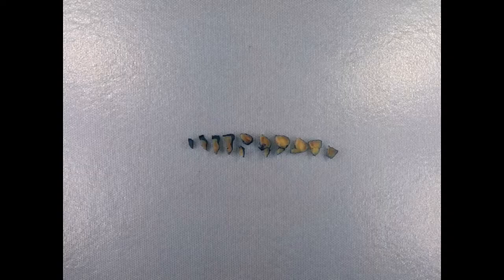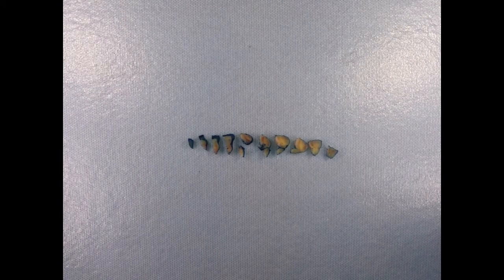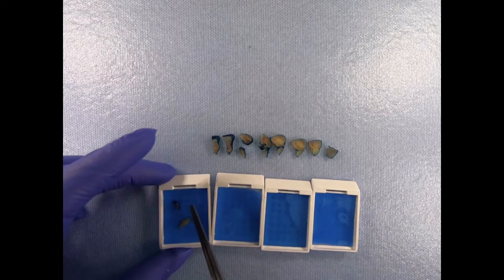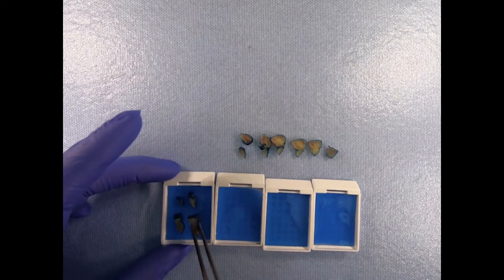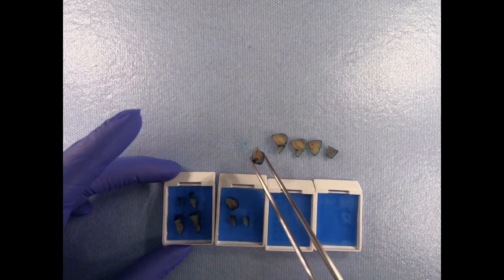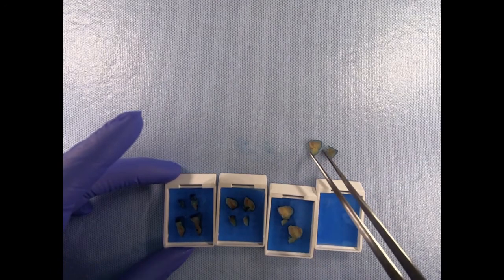Internal examination. If tumor can be identified, describe the lesion, depth, invasion, and distance to the margins. Processing. Submit the entire specimen sequentially, working from one end to the other. If the specimen is oriented, specify the 3 o'clock and 9 o'clock ends. Add the appropriate levels, and the specimen is ready for processing.